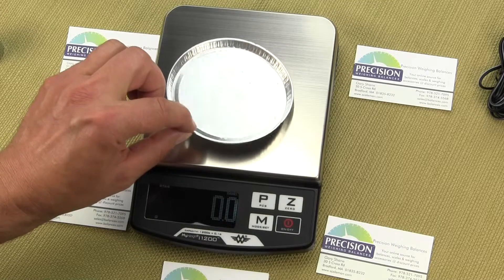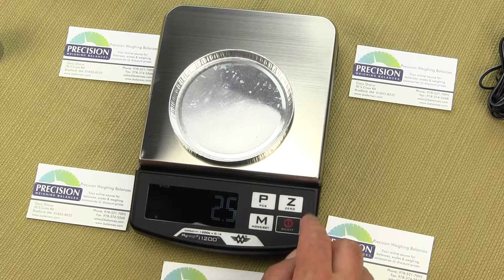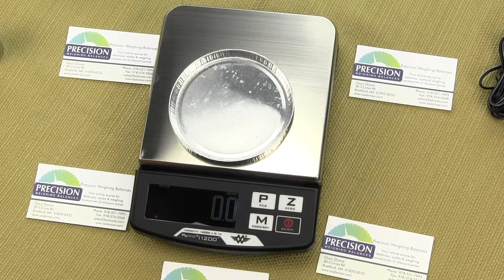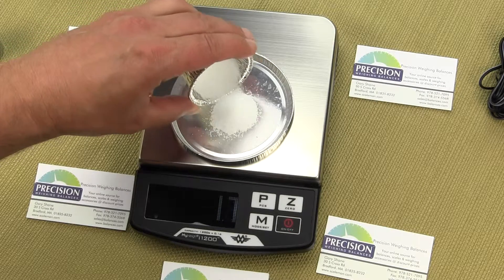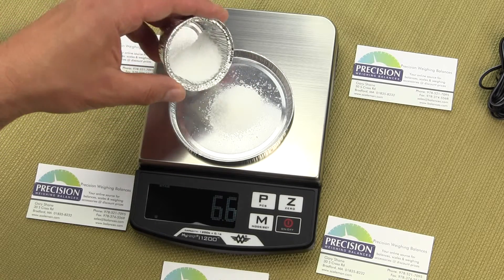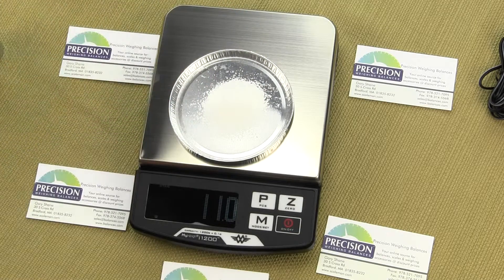We want to show you some of the performance. We're going to put on an aluminum dish and then tear the weight of the dish. The dish right now weighs two and a half grams. If we press the Z key that tears it out, and then we'll slowly add weight to give you an idea of the response time of the balance. Right now we have it in grams.